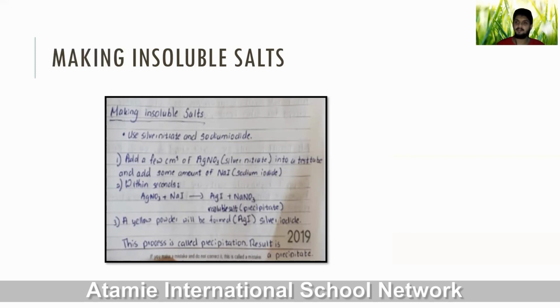So what we did in this video was all these practical concepts that could be used in the laboratory. We learned how to obtain soluble salts, for example sodium, potassium, ammonium, and then soluble salts which are not part of that. And then we learned different techniques. And then finally, we learned about making of the insoluble salts. So three techniques, right? All the steps are clearly shown in these slides.